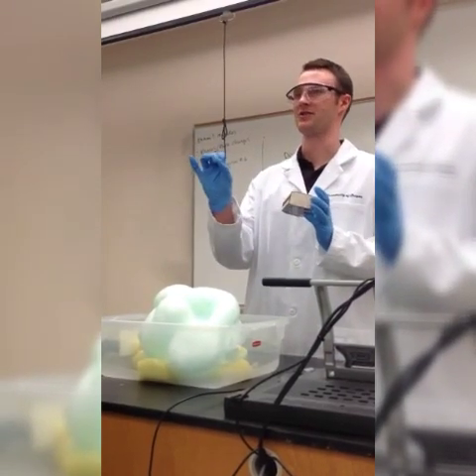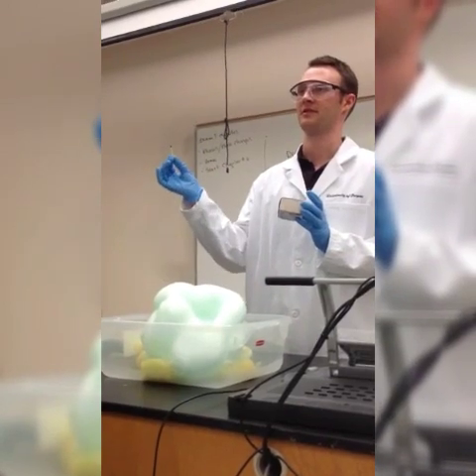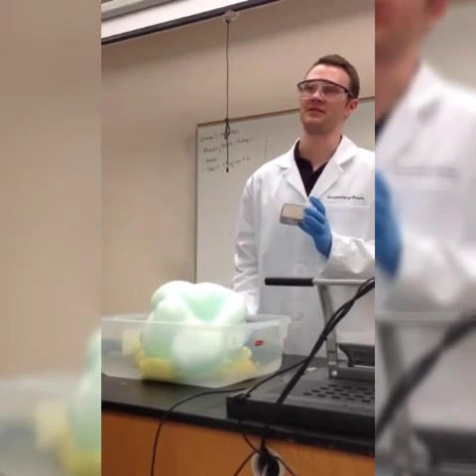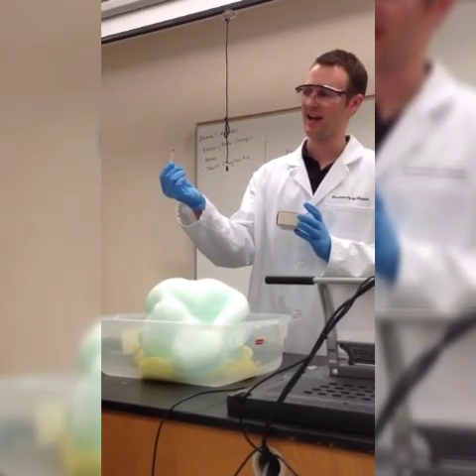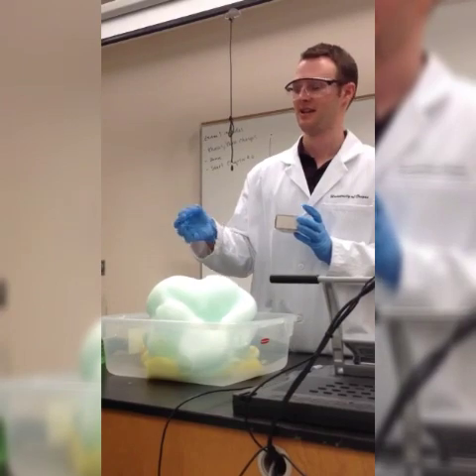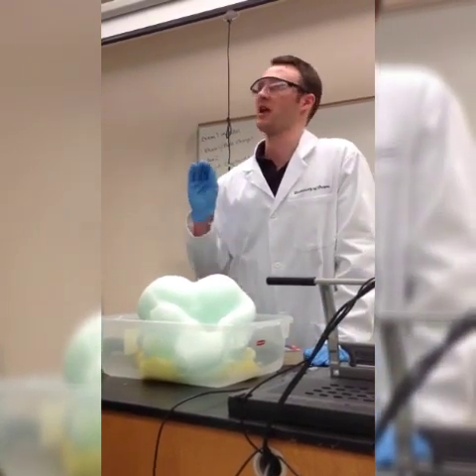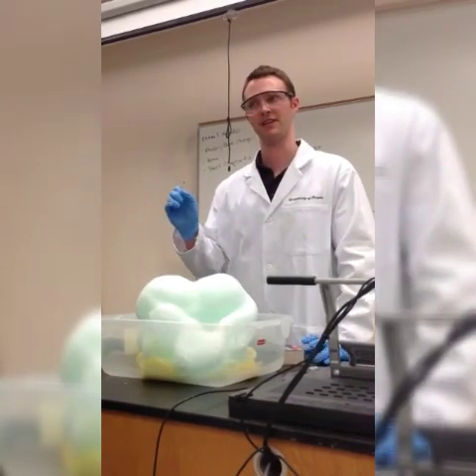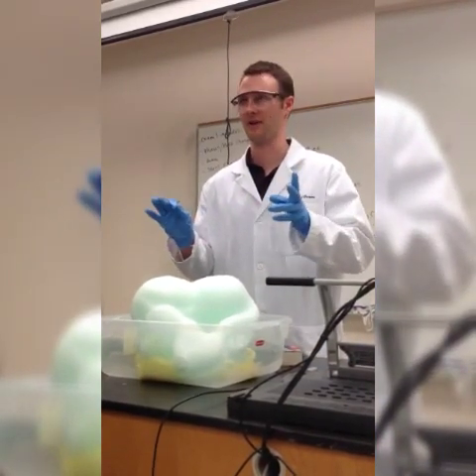So before, I lit a match with the CO2 stuff, and what happened? I kind of blew it out even when I got close to this stuff, right? But what's in these bubbles? And so what do you think will happen with oxygen? It's going to help this burn faster. A lot of people think oxygen is flammable, like those tanks. We'll talk about this a little more. It's not flammable. You can't light oxygen on fire.